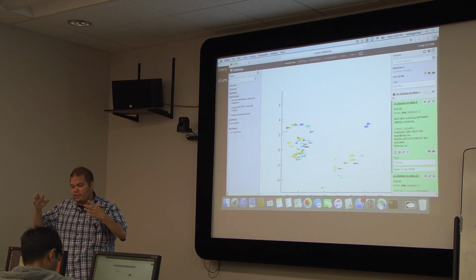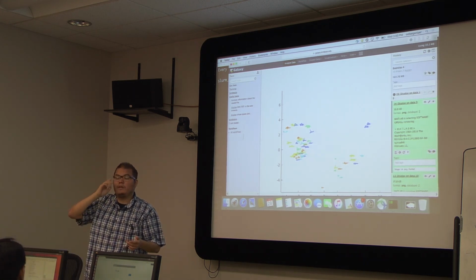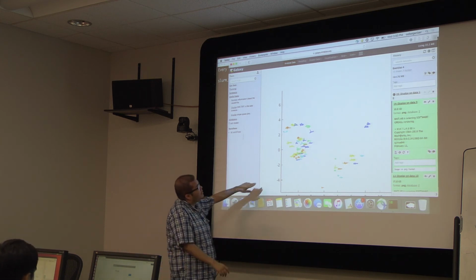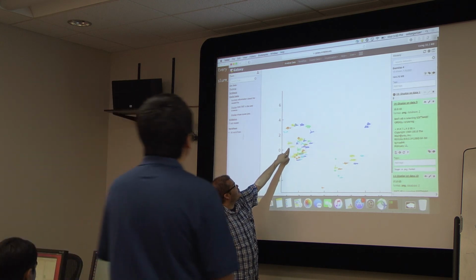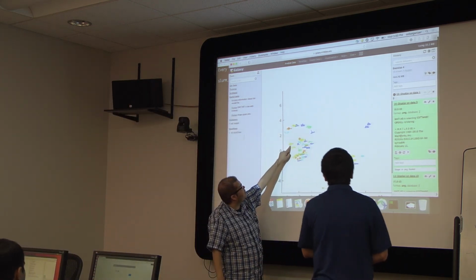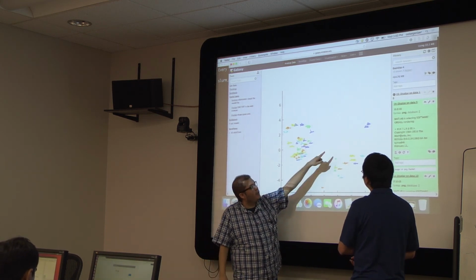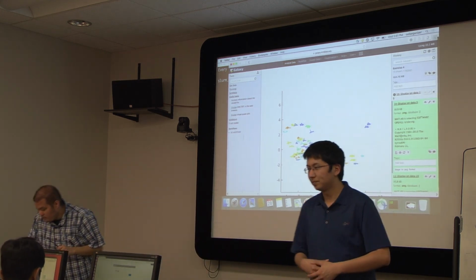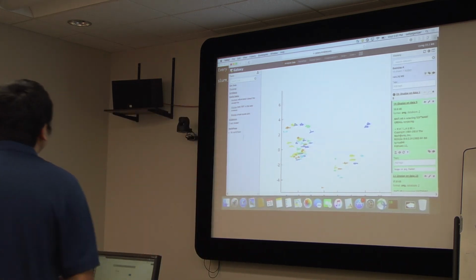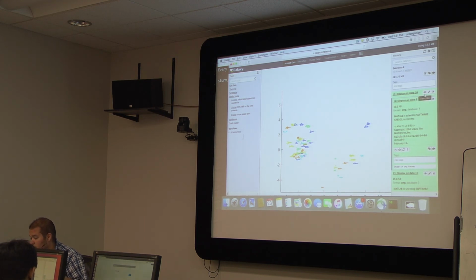changes in direction, though we register the images when we compare the distances, right, Chantal? Right, so you can see how in this case they are thinner, but they have these little things to the side. These are more cylinder-like, and over there they're a little bit thicker. And then again, whatever shapes you decide to use to build your model are going to provide you with different results.